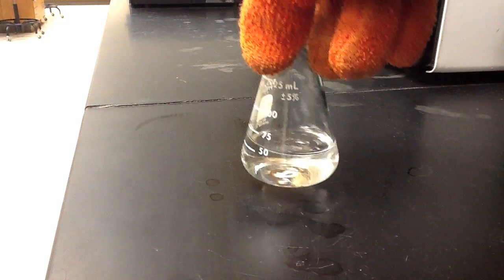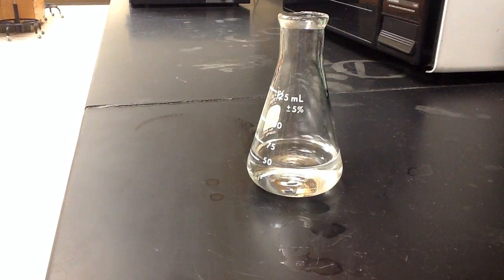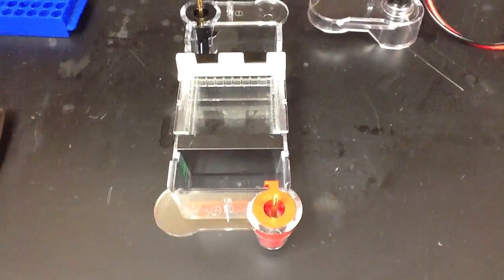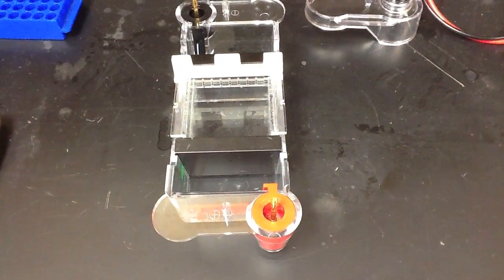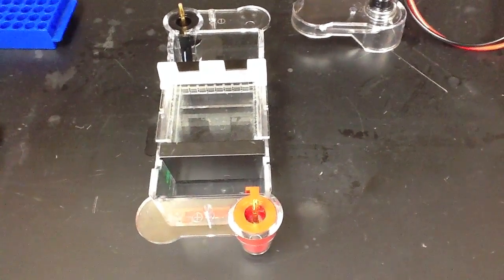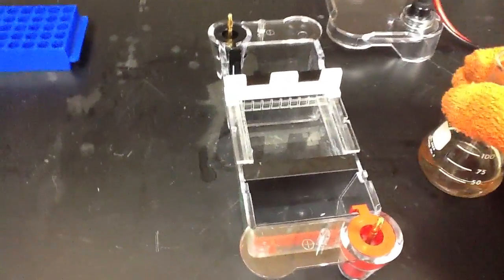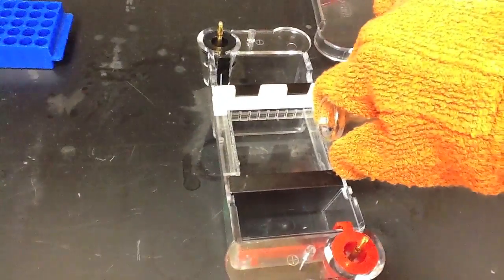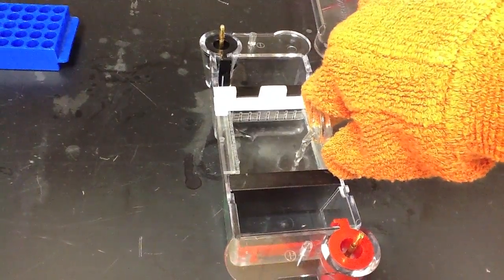Once the agarose has been mixed into the TBE buffer, we're ready to pour our gel. We start by assembling our gel apparatus with a comb, a casing, and two barricades. We then pour the hot agarose into the gel casing and allow it to sit at room temperature until it solidifies.